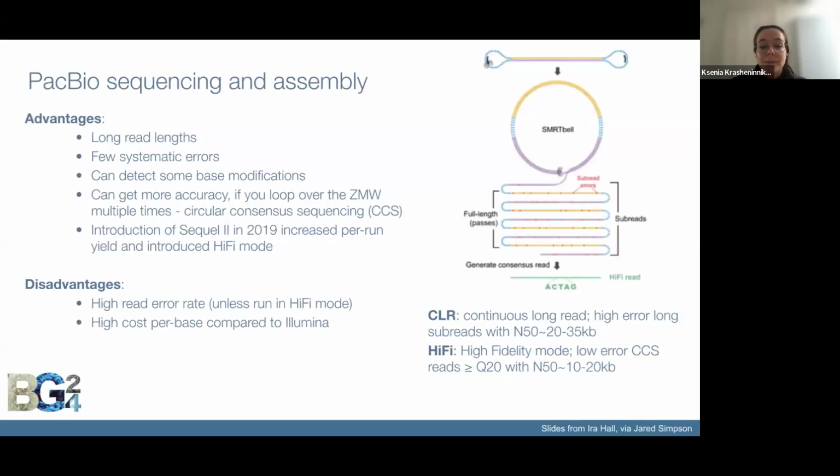We will now go through some sequencing technologies. PacBio sequencing started in the late 2000s. As of now, there are two types of PacBio sequencing data: CLR, which stands for continuous long read, and HiFi, high fidelity mode, introduced in 2019. The sequencing process occurs inside small wells on a microchip called an SMRT cell, which contains millions of these tiny wells. HiFi sequencing uses fluorescent light signals to identify DNA bases, pretty much as CLR sequencing does.